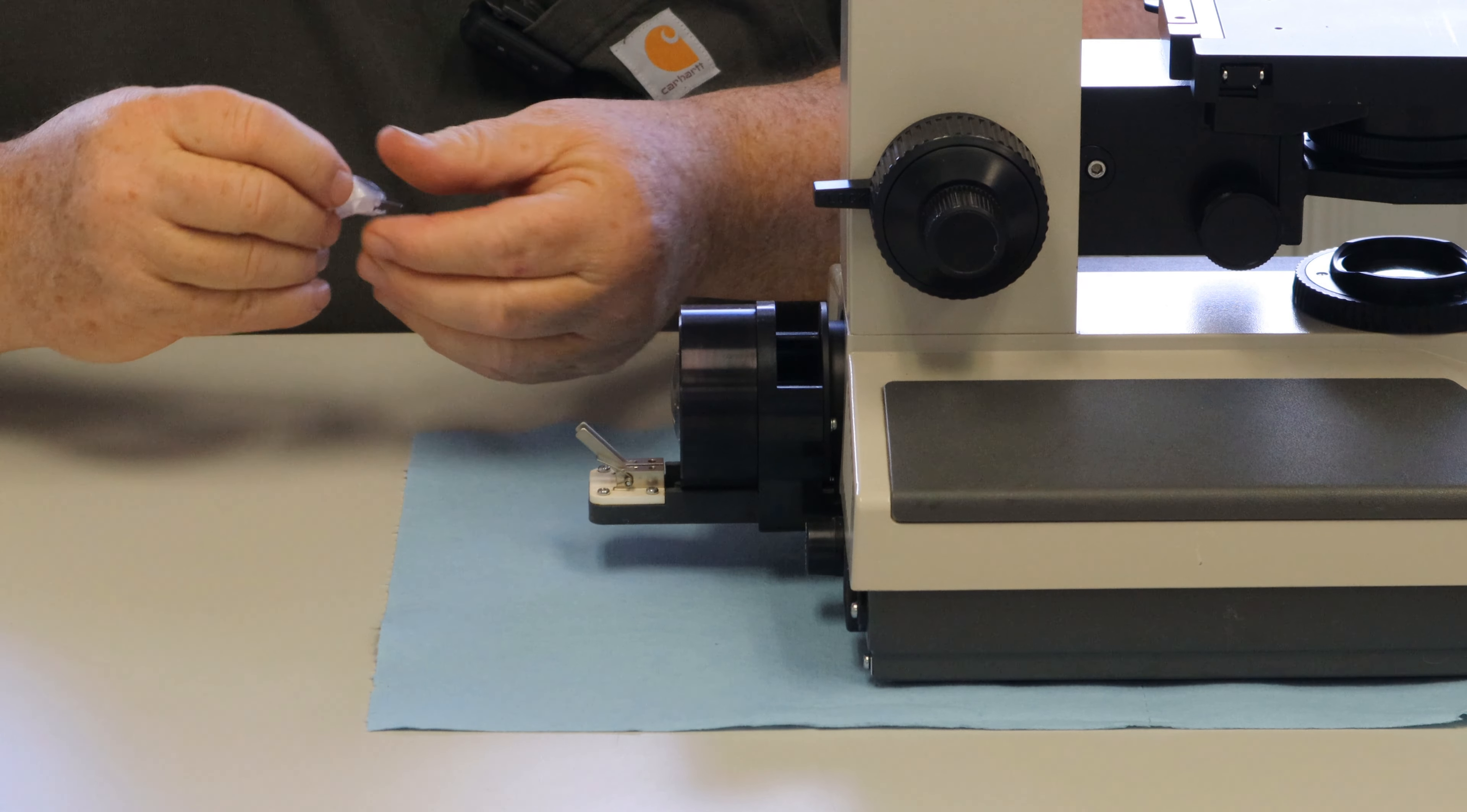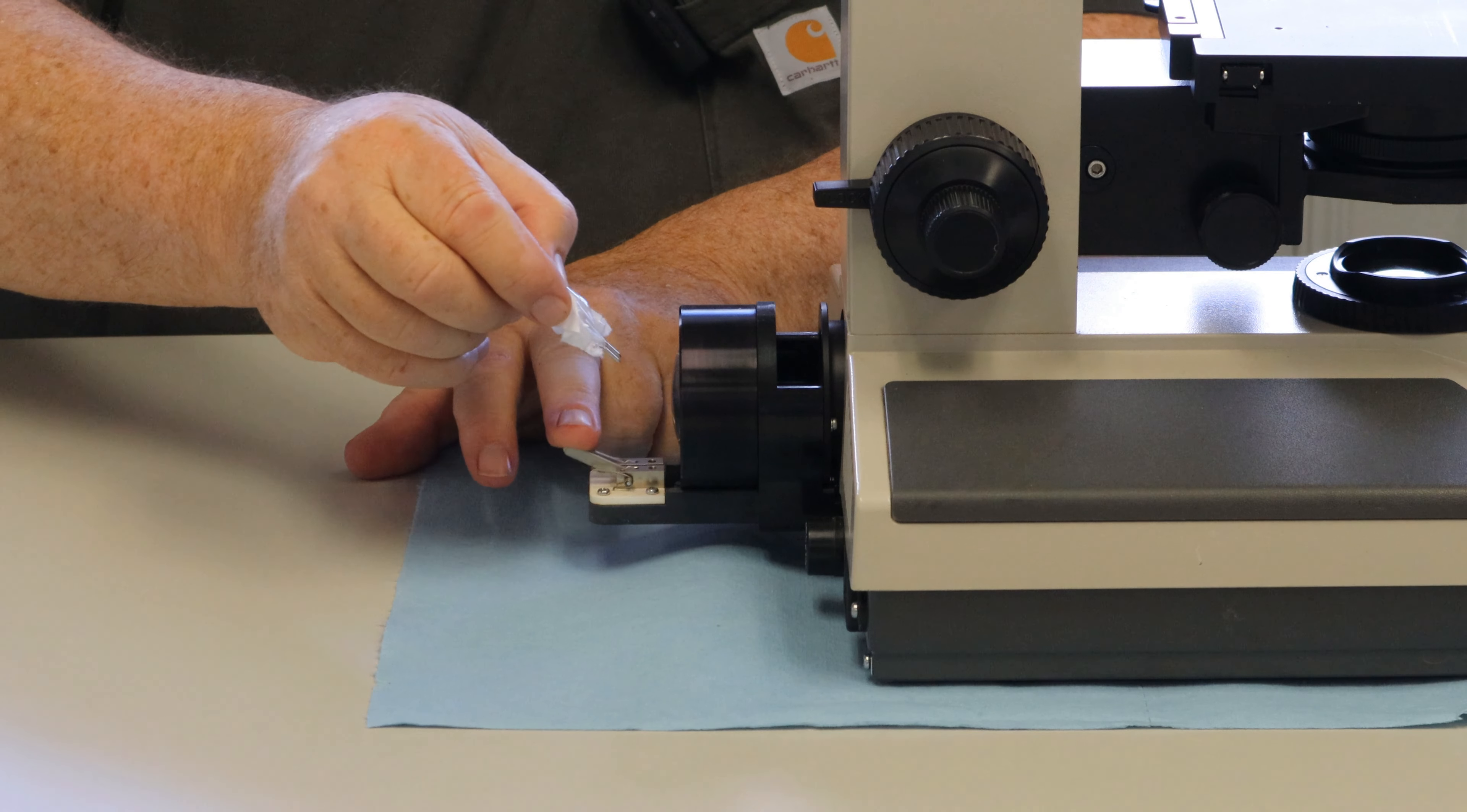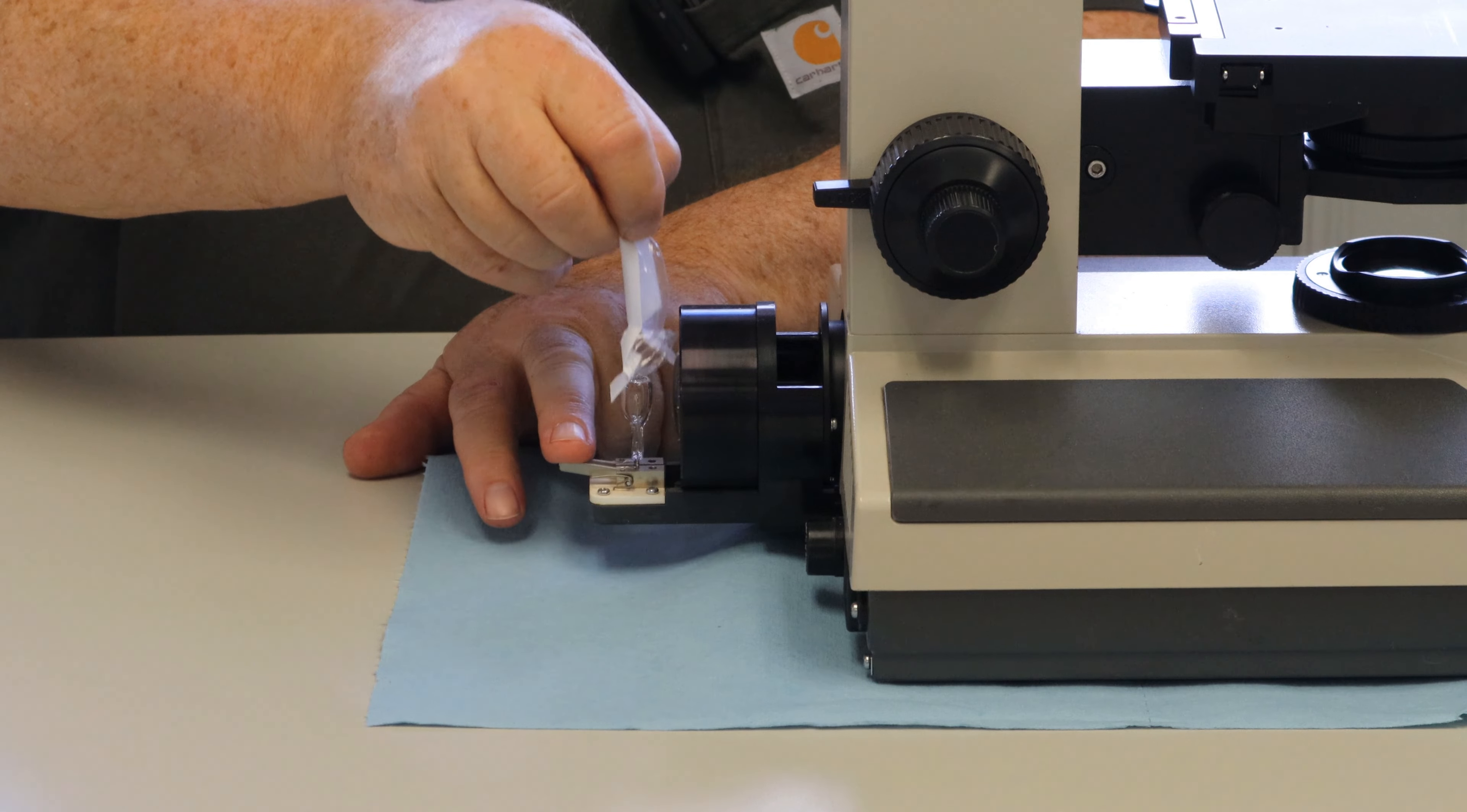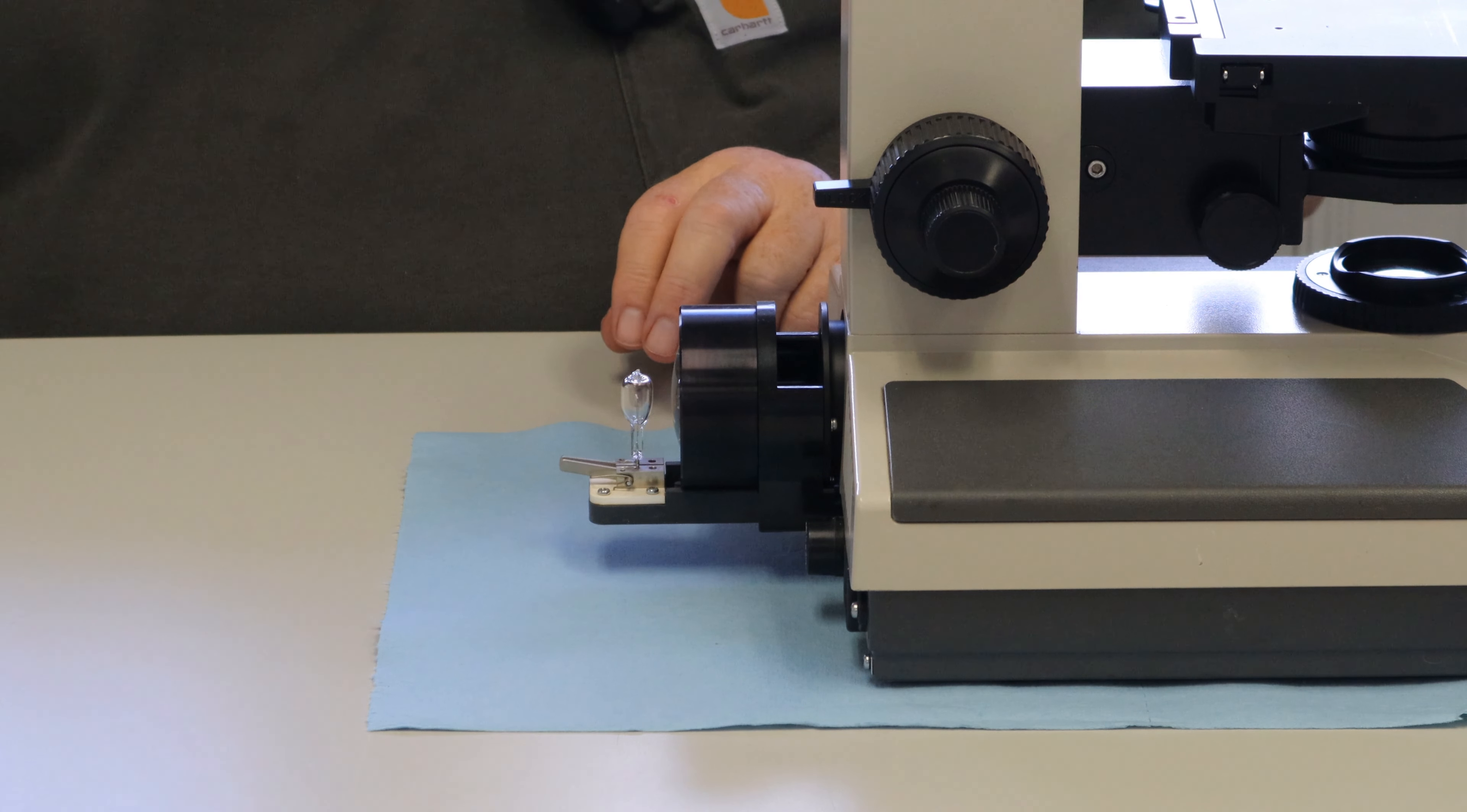If you happen to get your fingerprints on the globe, you can simply wipe it down with acetone or xylene and a chem wipe.